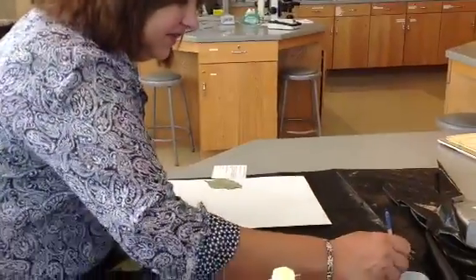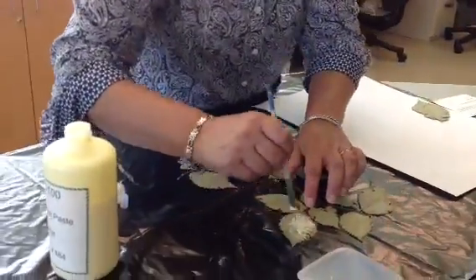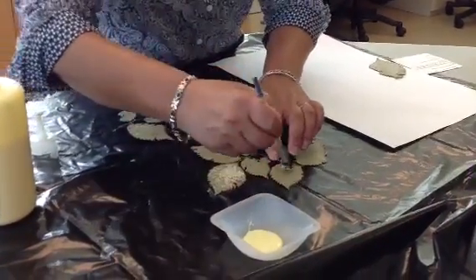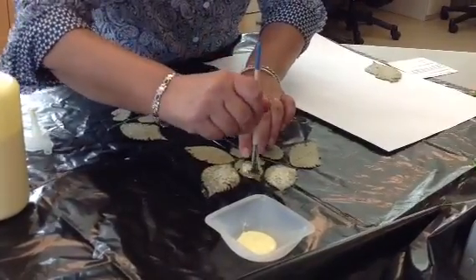I just begin by placing glue — painting it onto the back of my sample. This way I'm not doing this on the herbarium paper; I'm doing it on the plant itself. If the glue is too thick, you can always thin it with a little bit of water. Just paint this on.